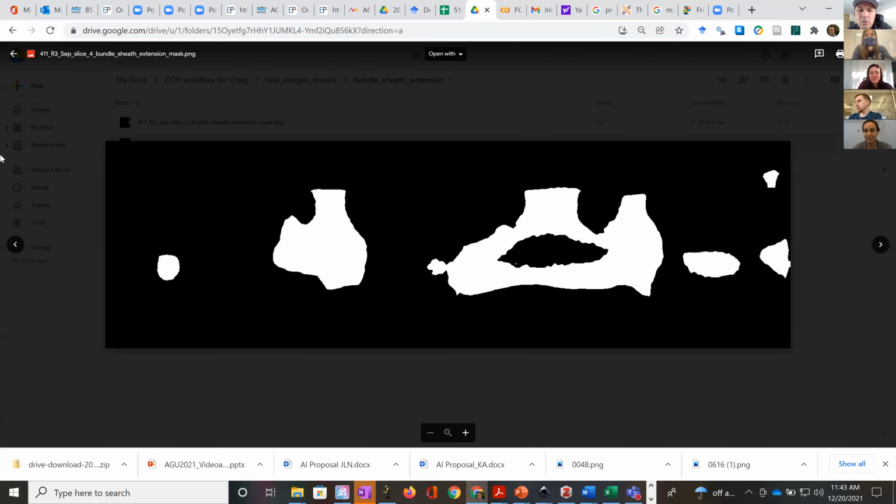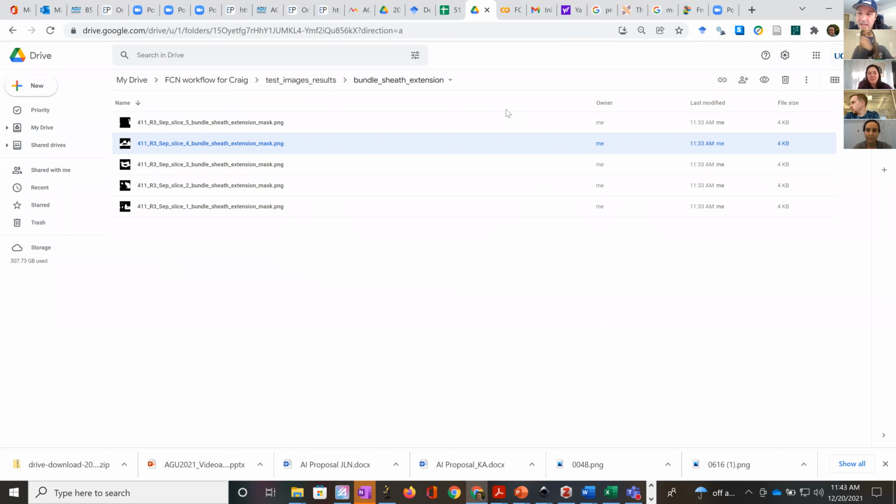Yeah, I think so. I haven't shown it here, but there are ways to identify the stomata specifically. It will just take some work. If you were to annotate stomata in the stack, like if you were to reslice the stack so that you were looking at it going down through the epidermis from the top to the bottom, you probably could use this code to identify the stomata.